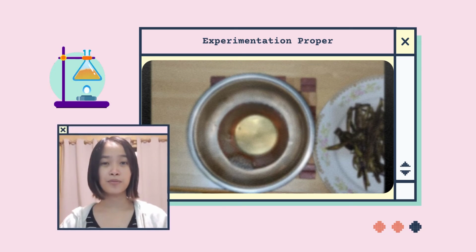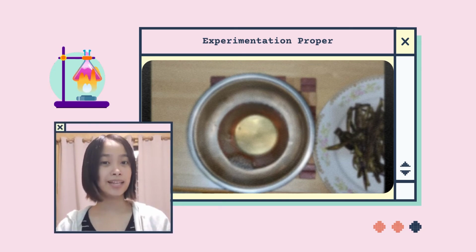After that, we will now observe its color change and proceed to the results and discussion.